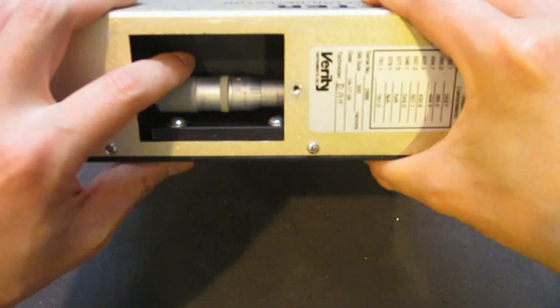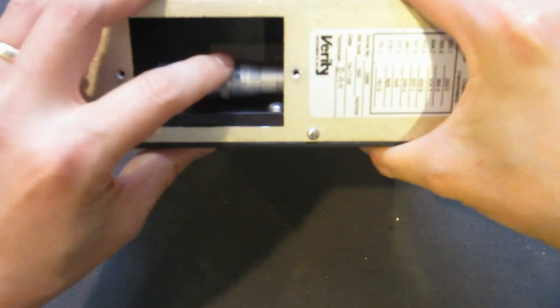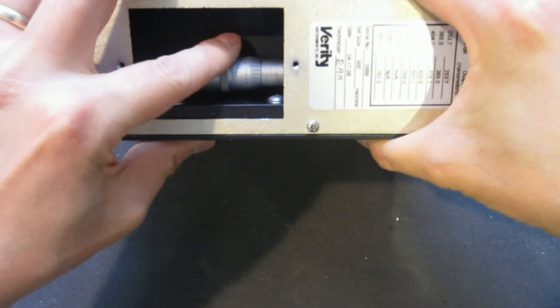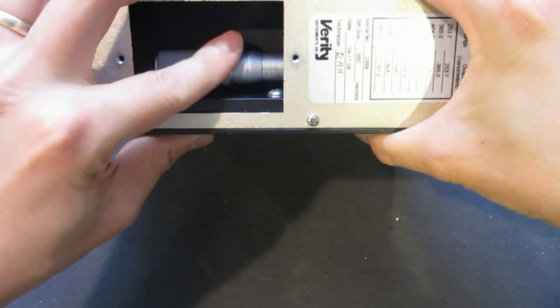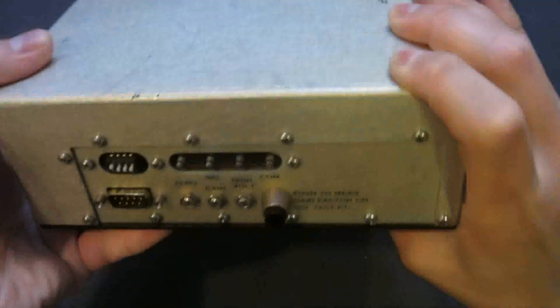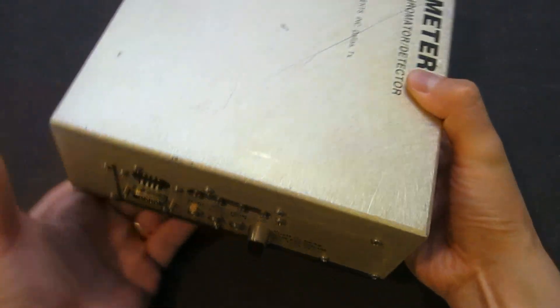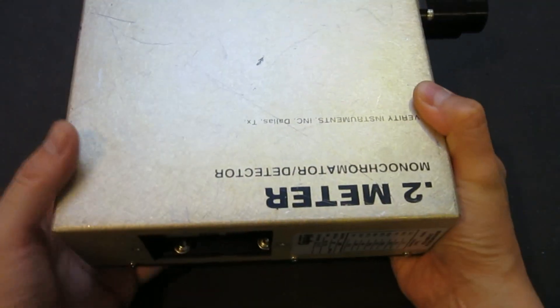One drawback of this kind of manual scanning monochromator is that you have to, on one hand, turn the dial very slowly, and on the other hand, monitor the output voltage to see the signal you're trying to detect.